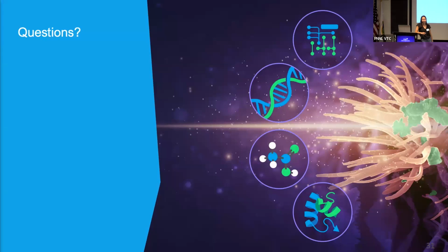Awesome. And then in the last presentation, you mentioned two user interfaces, MODE and MAP. And then you had this really cool display with all of the graphs and filtering and everything. Was that either MODE or MAP? The display that I showed you was one that we created from within R ourselves. Okay, cool. But if you go through either of those user interfaces, you'll get something that looks very similar. Yeah. Same sort of interface. Thanks.